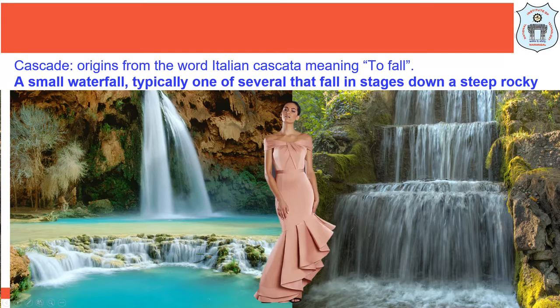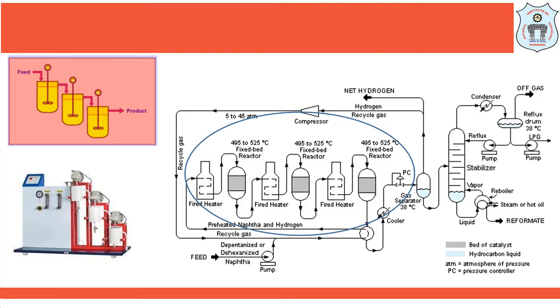Even in the chemical engineering context, a cascade is a plant consisting of several similar stages, with each processing the output from the previous stage. Mostly these cascades are commonly used in isotope separation, distillation operation, flotation, separation and purification processes, and even in reactors like CSTR reactors. In general, a cascade process is any process that takes place in a number of steps, usually because a single step is inefficient to produce the desired product.